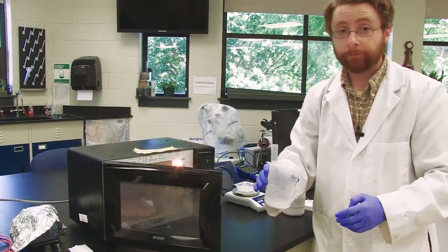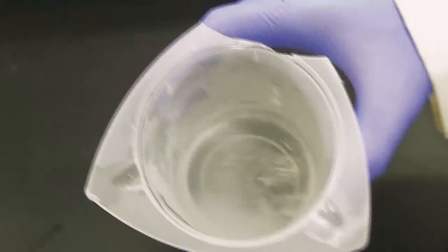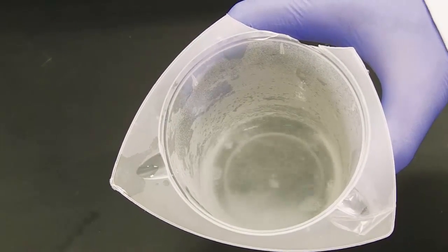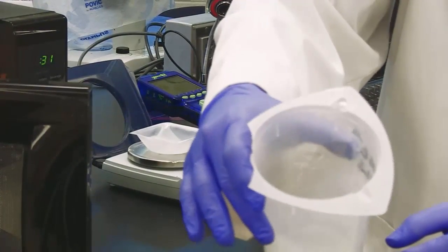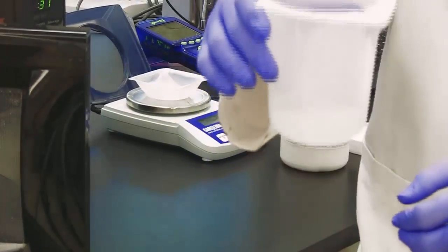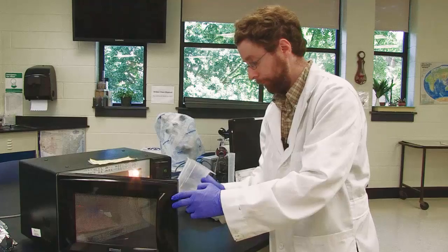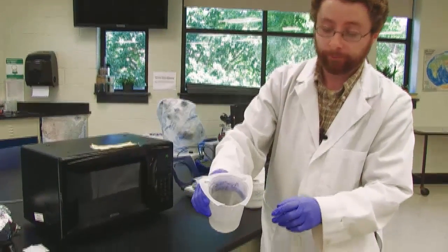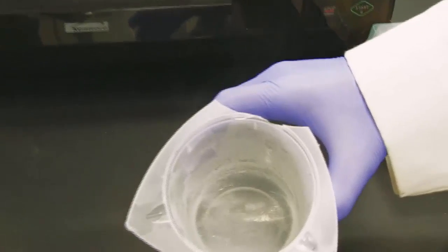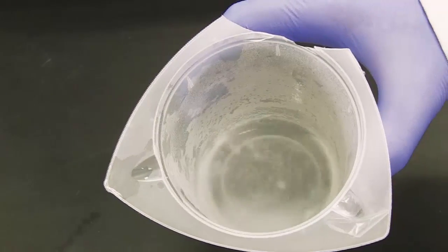Thirty seconds has elapsed, and if you look, you can see that there is still powder visible in the container, so the agarose has not completely dissolved. I'll give it a little bit of a mix, and then back into the microwave for about 15 more seconds. Fifteen seconds has elapsed, and you can see almost all of it is dissolved. There is still a little bit of powder left, so we'll give it another 15 seconds.